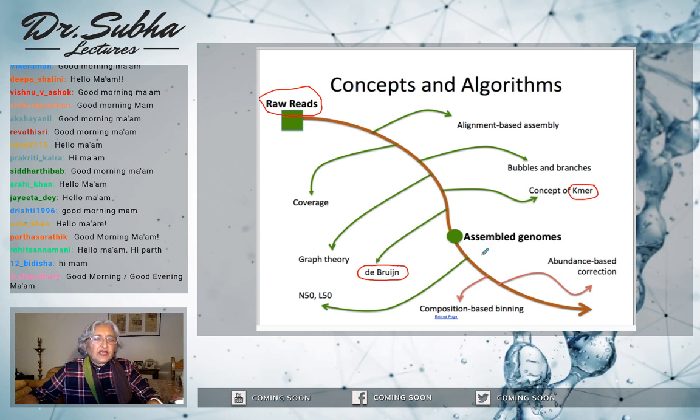right? And then after you assemble the genome, you got this N50, L50, which we use to say, how good is my assembly? Person A has assembled a genome using some other methods, person B has assembled the genome using some other method. Which one is good? How do we measure the goodness of assembled genome? Okay, completeness or goodness. That's N50 and L50.